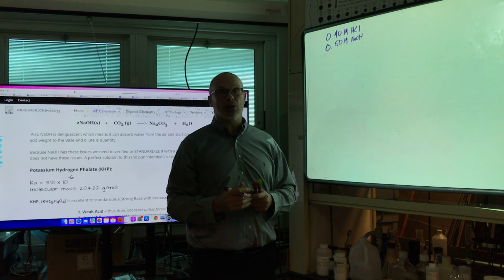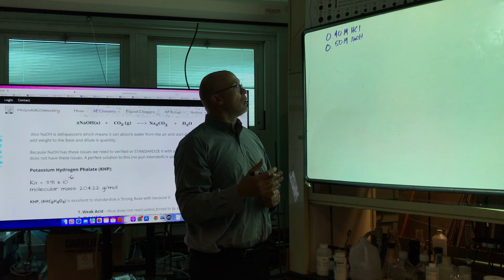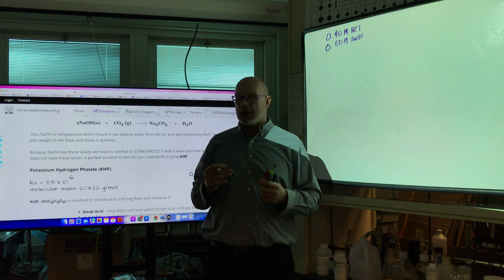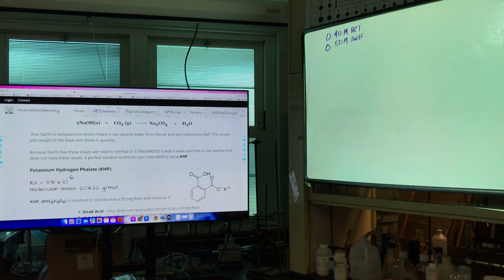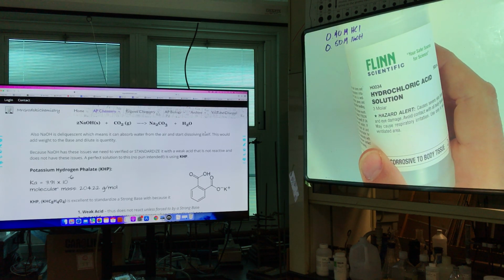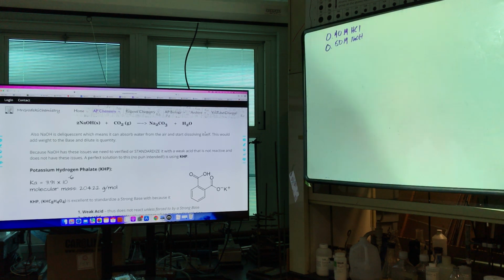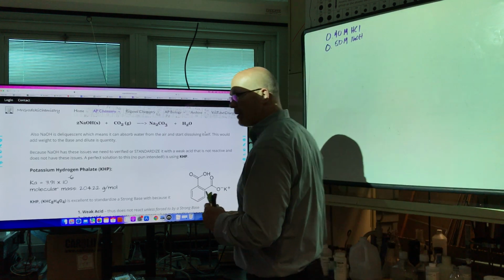All right, so let's start with the hydrochloric acid, okay, and I made it this morning. Very simply, I started with a stock bottle. That stock bottle was something that I am very sure is correct because I bought it brand new, okay? And what I have in stock solution is hydrochloric acid. And notice the molarity, 3. Now, actually, it's 3.00, okay?